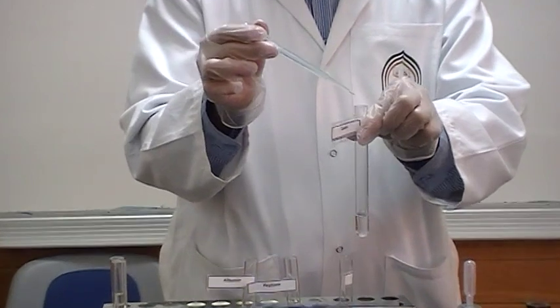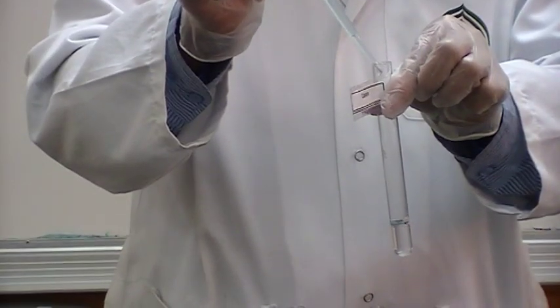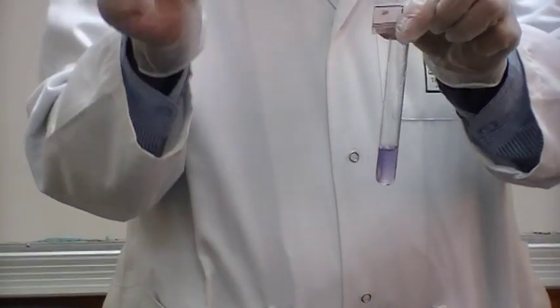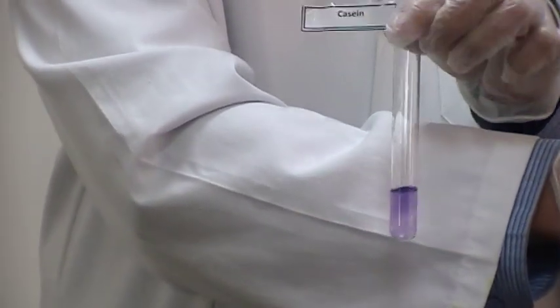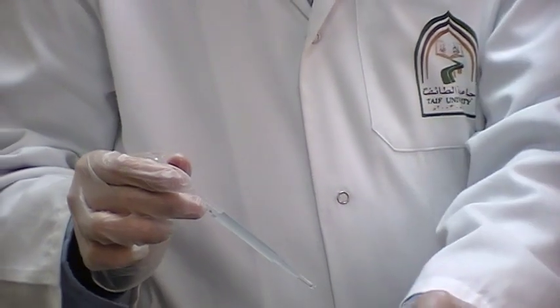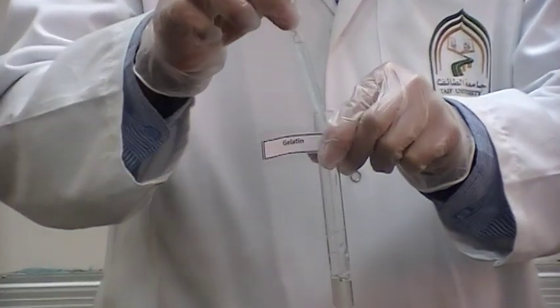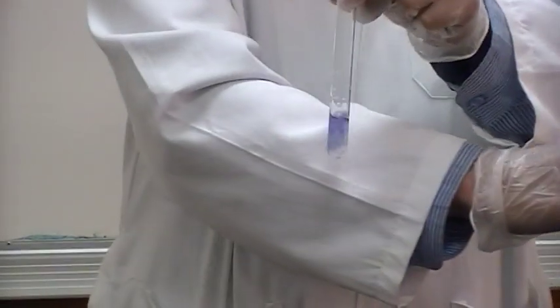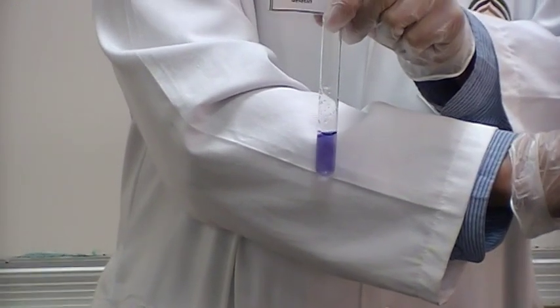Let's see what we're going to get. Can you see? Violet color with casein. Let's see what about gelatin. Still violet color with gelatin too.